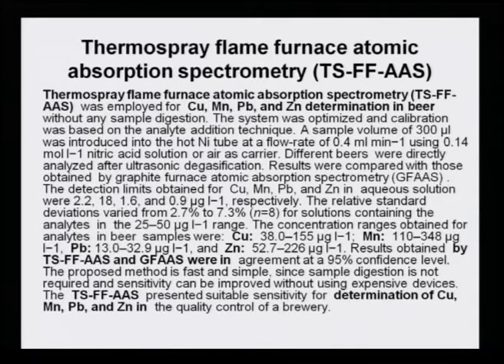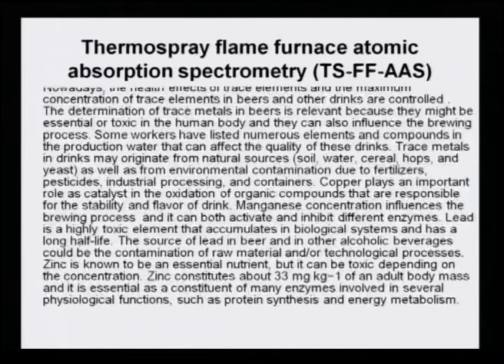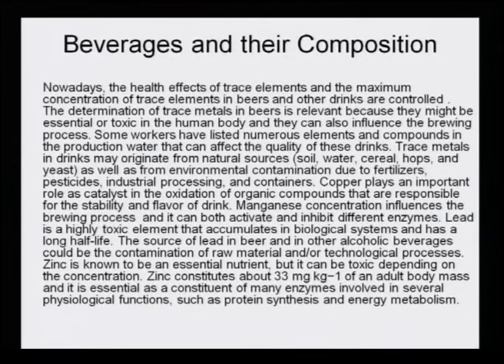The proposed method is fast and simple. Since sample digestion is not required and sensitivity can be improved without using expensive devices, the thermospray flame furnace atomic absorption spectrometry presents suitable sensitivity for the determination of copper, manganese, lead and zinc in quality control of the brewery industry, beverages and their composition.